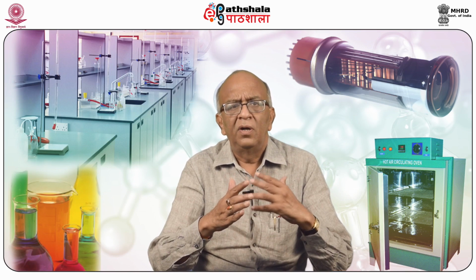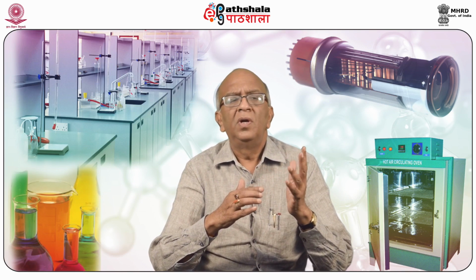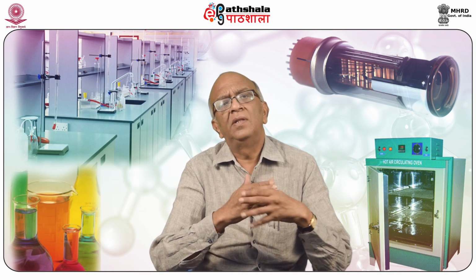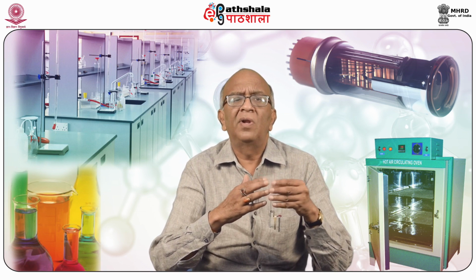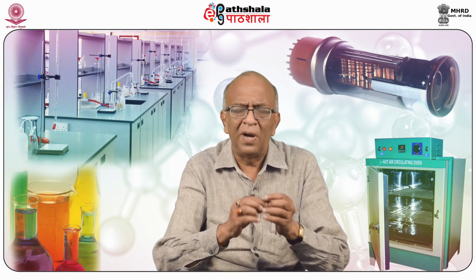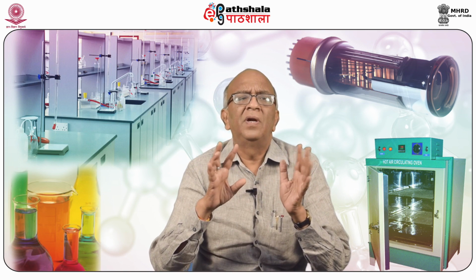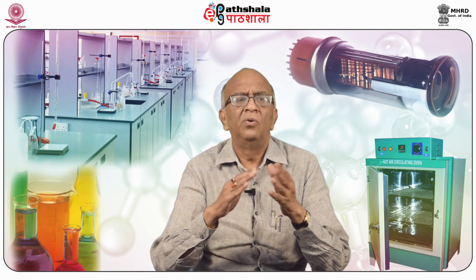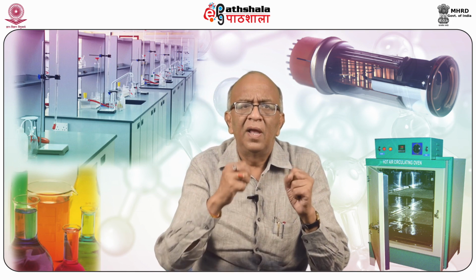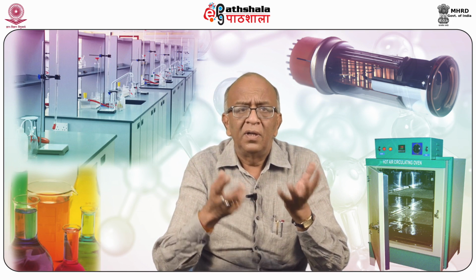So, in this lecture today, you have learned a very important thing: how to maintain neatness in the laboratory, how to clean the glassware. Because if your glassware is not clean, if some oxidizing agent is there, if a small particle is there, then it will destroy your whole experiment. Error will be there. If you are doing kinetic studies and a small particle of oxidizing agent is adhered to the glassware, then it will change the rate of your kinetic reaction.